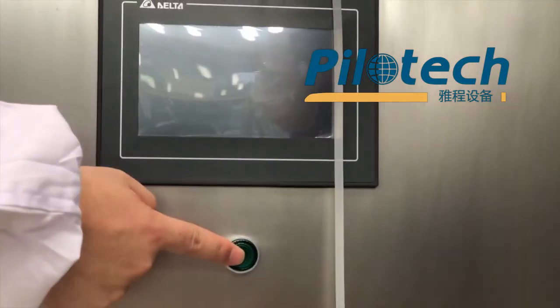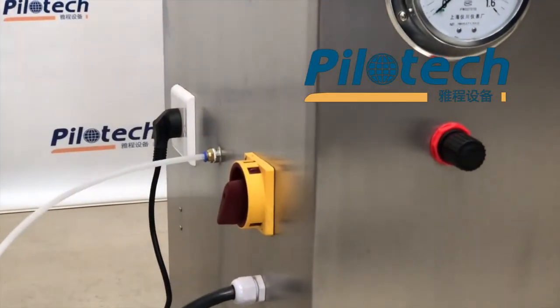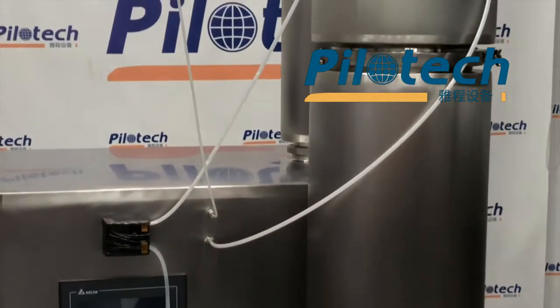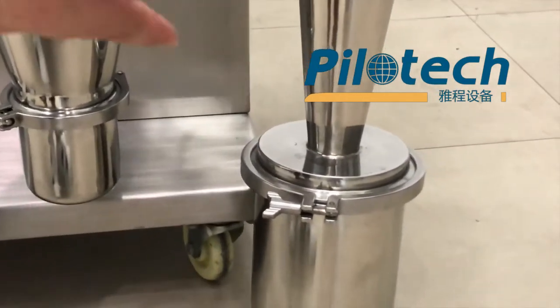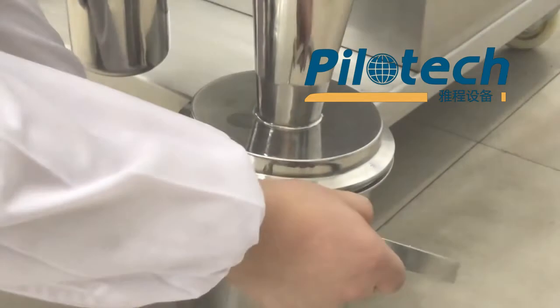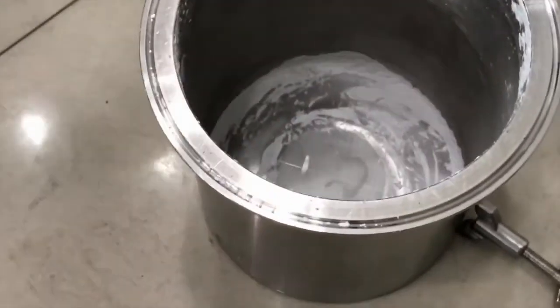Turn off the touch screen, then turn off the main power switch. Wait for the collection bottle to cool down, then we can remove it. Now the collection bottle is cooled down. We can remove it. That's the end of the experiment.